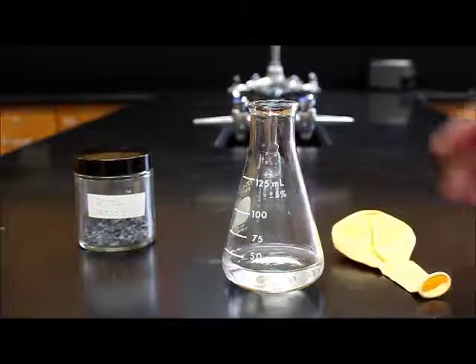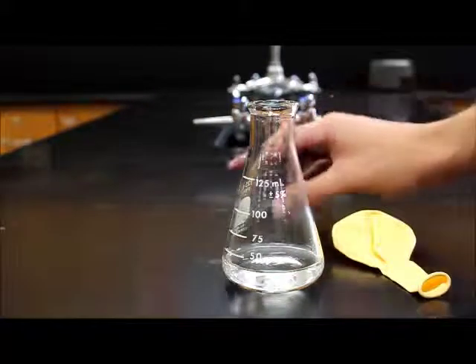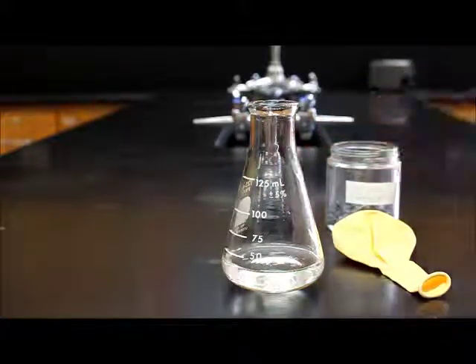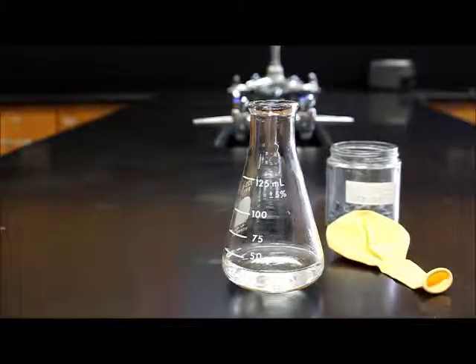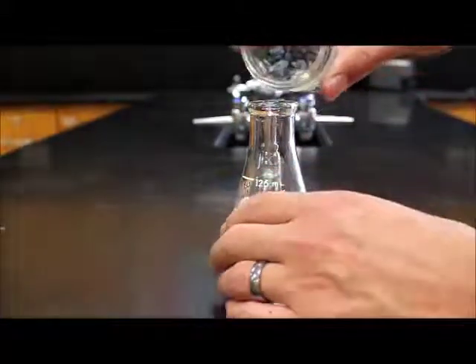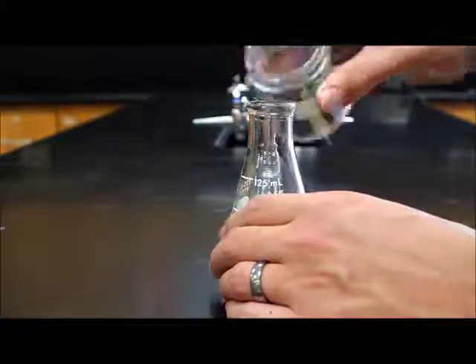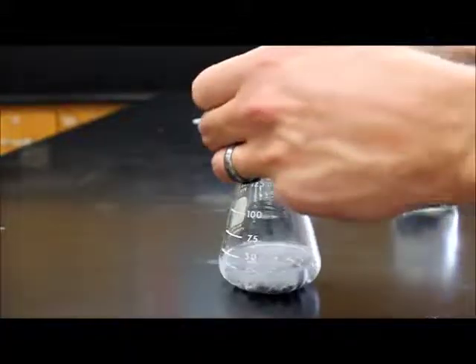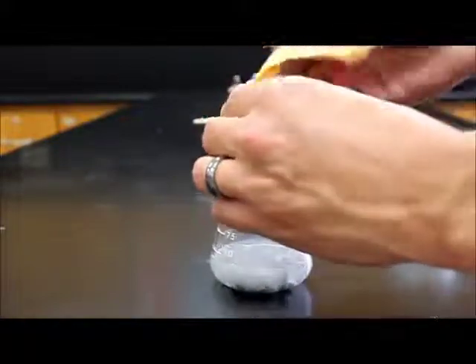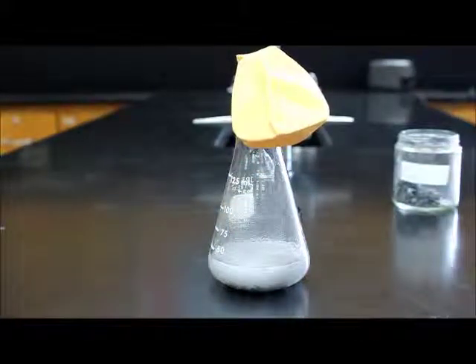So what I'm going to do is take some mossy zinc and put that mossy zinc into my hydrochloric acid, which is going to start the single replacement reaction. And then I'm going to put the mouth of the balloon here over the top of the flask and try to capture the gas. So here we're going to put some mossy zinc into our flask. We're going to cap this with our balloon, and then the balloon is going to eventually get filled up with the gas being produced by our reaction.